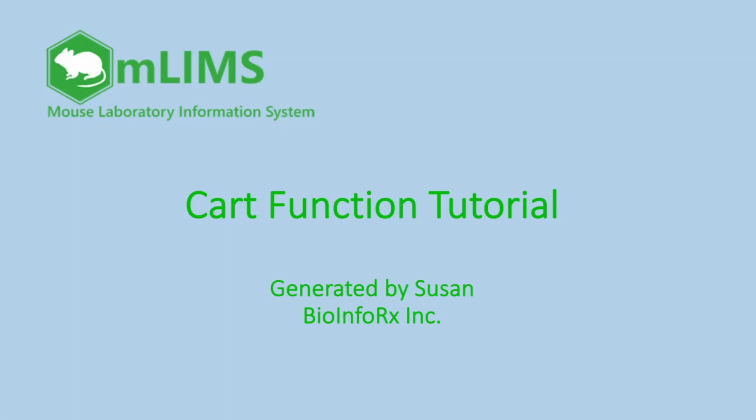mLIMS cart function tutorial, generated by Susan from BioInfoRx.